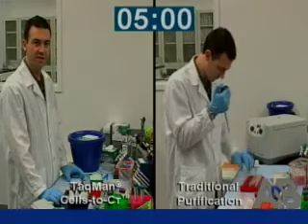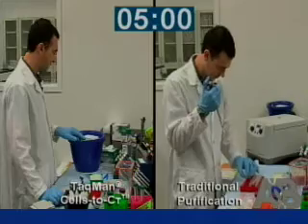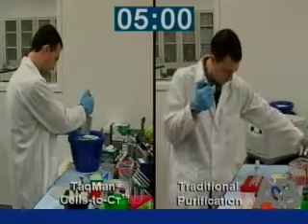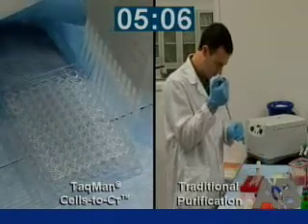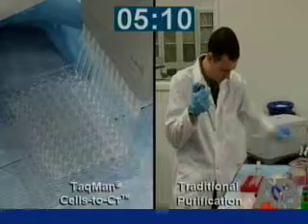After the five minutes at room temperature is complete, we need to stop the lysis reaction. What I've done is aliquoted out the stop solution into strip-well tubes, which will allow me to use a multi-channel pipette. We add five microliters of stop solution to each reaction, then pipette up and down five times to mix.